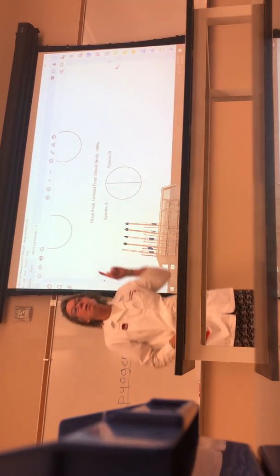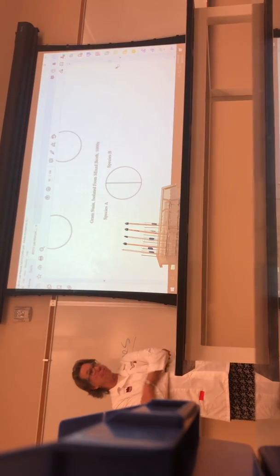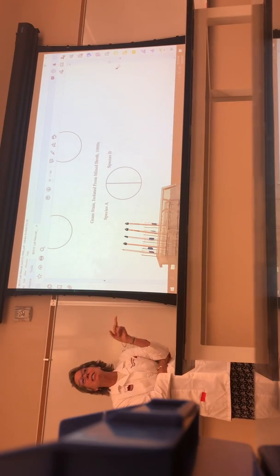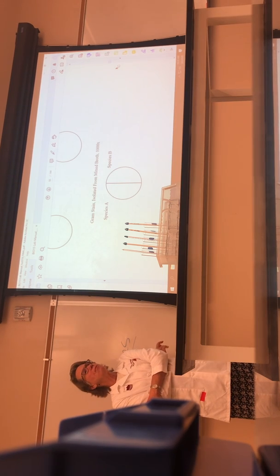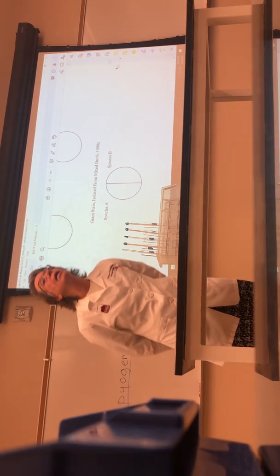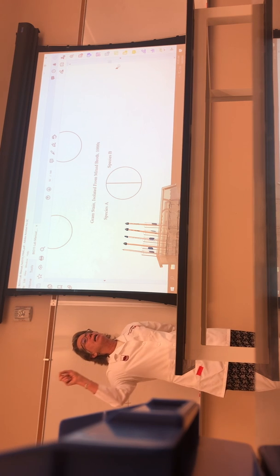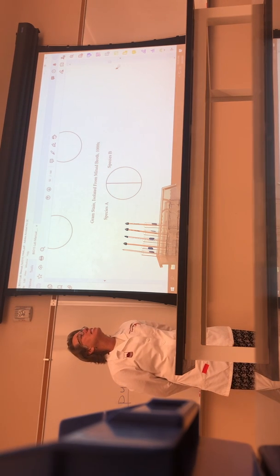Okay, and then we did one other thing. So again, I'm just talking while our temperatures are getting up there. We also took from the MacConkey and the salts. Guys, listen up. So how many of you had growth on a MacConkey? Okay, so I don't know if you remember this. If you had growth on the MacConkey, I told you to take a small bit of that and get it growing on a slant.